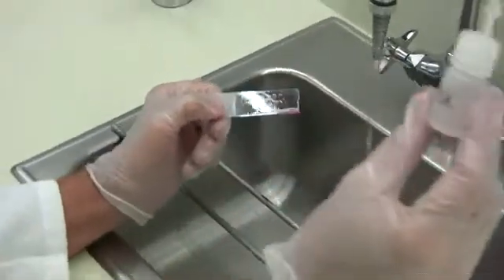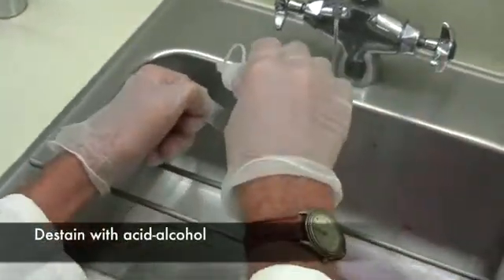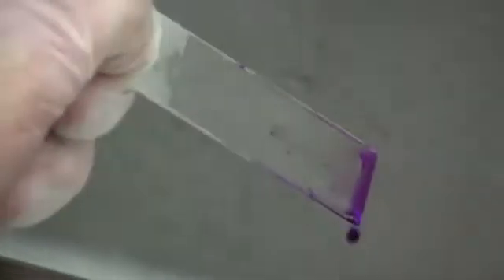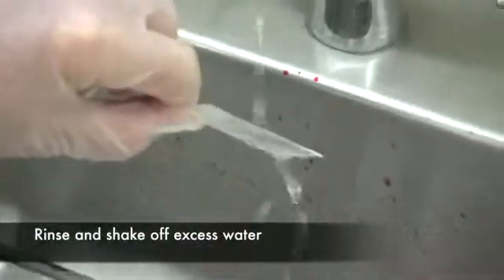Then you want to use acid alcohol for a de-staining step. Add it drop by drop until the pink or the purple stops running from the smear — it looks like it's going to take six or seven drops in this case. Then rinse the slide immediately again.